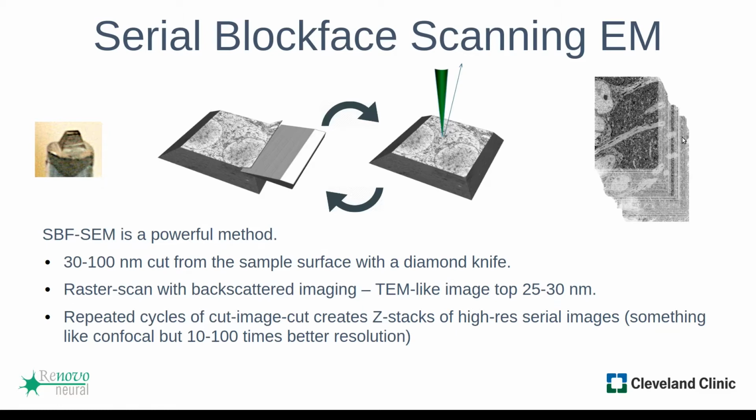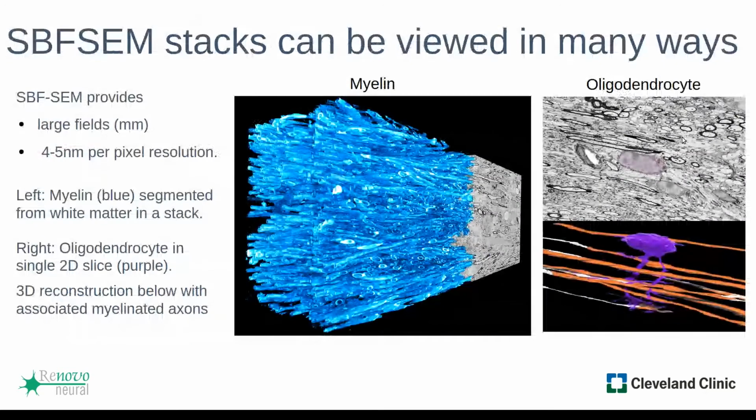So once you have a stack, there are a lot of different ways to use these. And here are two examples. Just to mention, our main usage of data stacks isn't to create pretty pictures necessarily, but we enjoy it. But our real goal is to extract the quantitative data that you can't get through other imaging modalities.